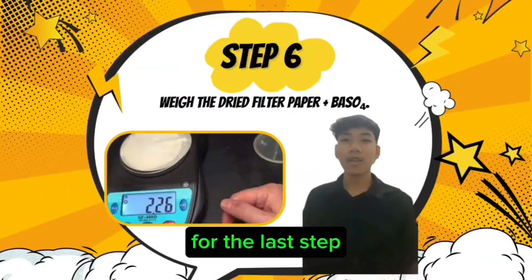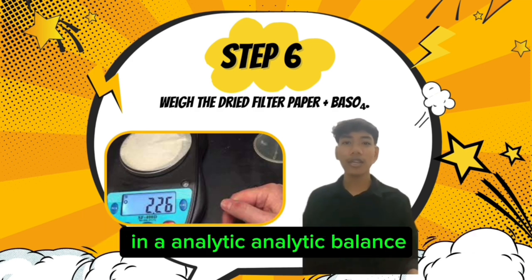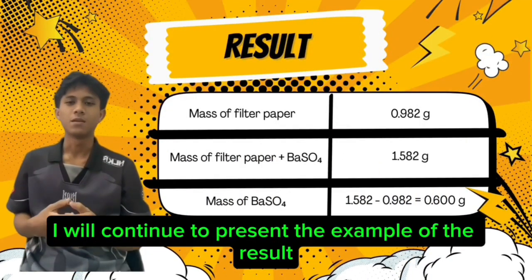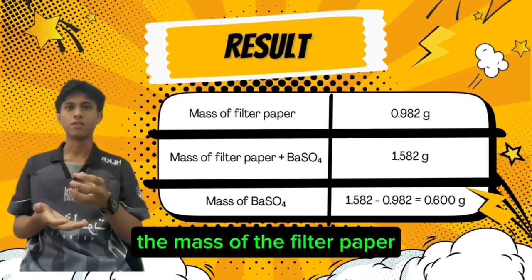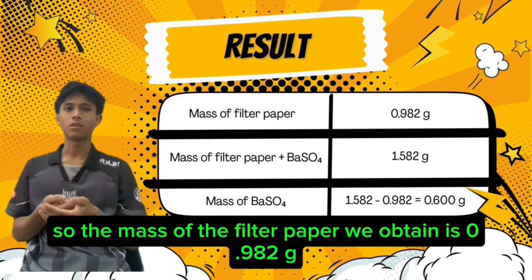For the last step, we weigh the dry filter paper plus BaSO4 on an analytical balance and proceed to the calculation. I will continue to present an example of the result we can obtain from the experiment. First, we weigh the mass of the filter paper on an analytical balance. The mass of the filter paper we obtain is 0.982 grams.